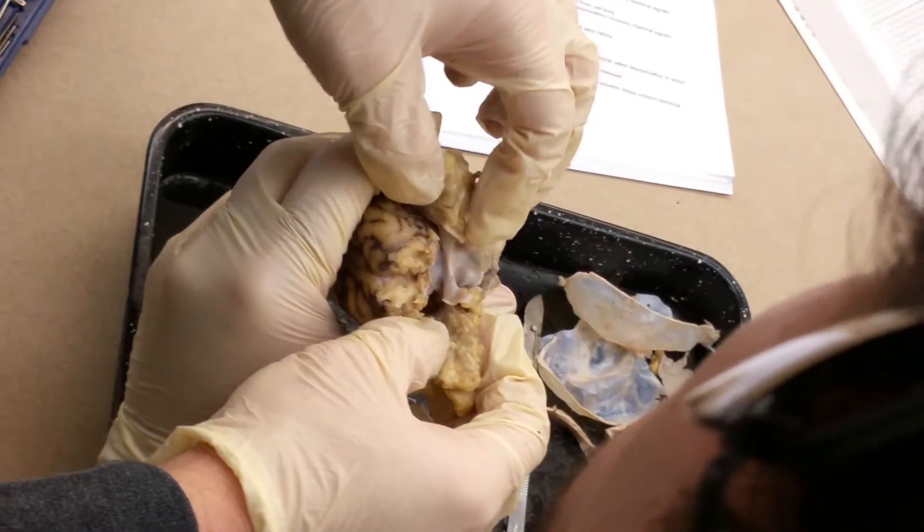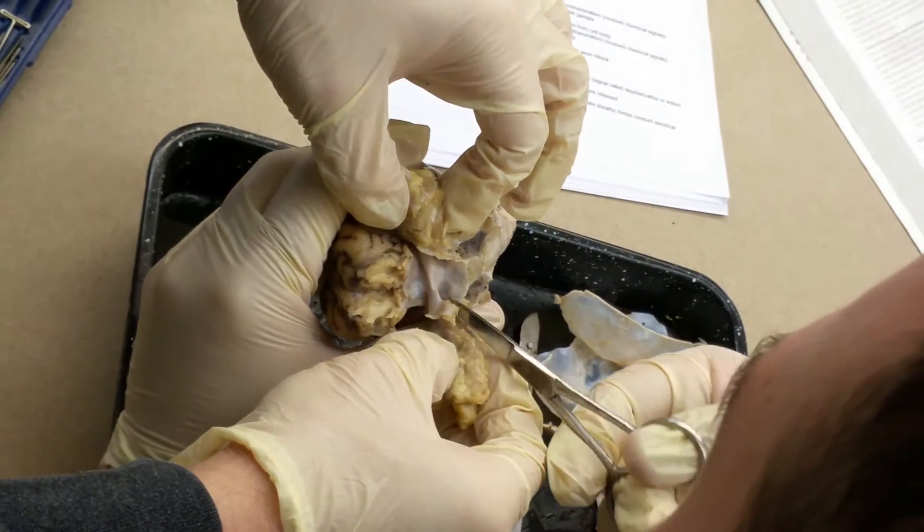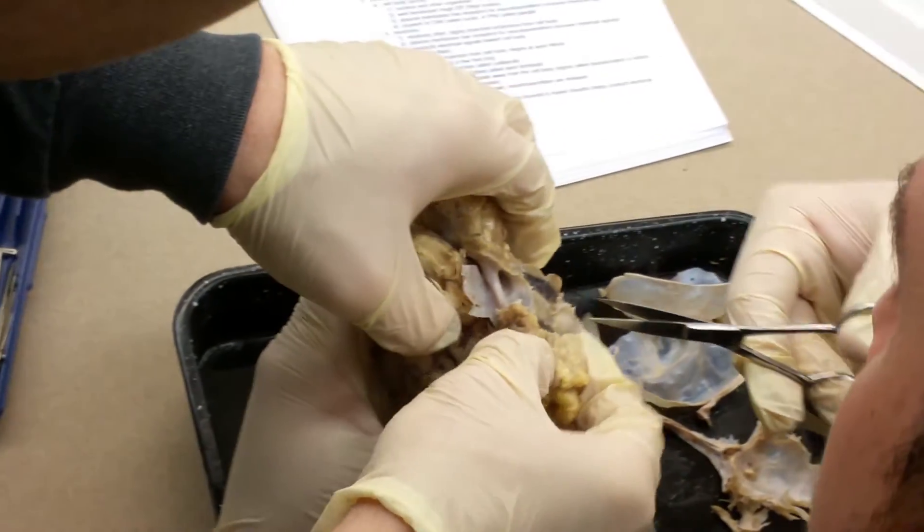That's the optic nerve there. You can go ahead and separate that there, and then take the rest of this off.